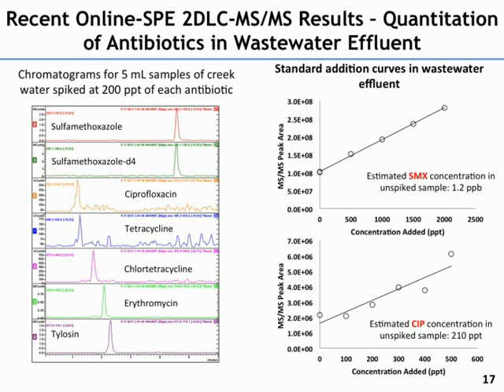And I'll point out that the sulfamethoxazole data look great here, right? Very nice curve. The Cipro doesn't look so good, and we're absolutely convinced that this is more of a problem with our detection variability. That's very compound specific, and again, this is related to the issue I mentioned a couple moments ago. From our perspective, in terms of getting sample into the detector in a precise way using this online SPE setup, it's very precise. And we've checked that out using UV detection and things like that. So again, that's representative data.